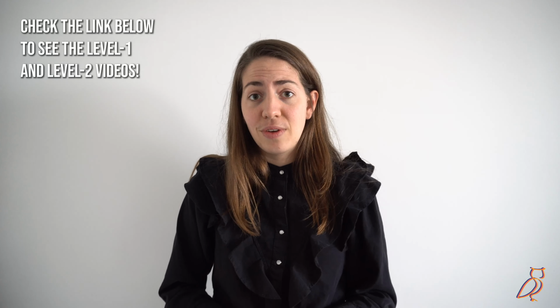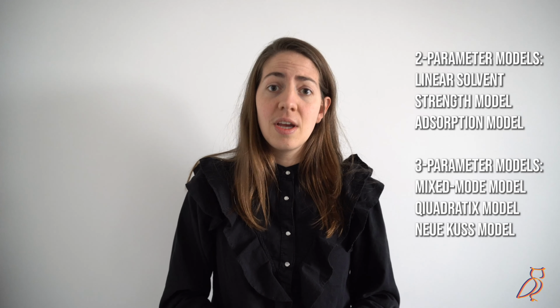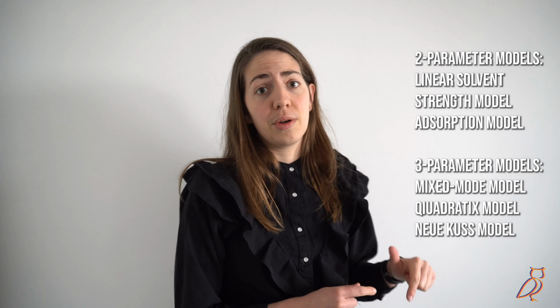So let me set the stage here, okay? You got intrigued by the idea of applying retention modeling and you go to the lab, you have a sample in one hand and a column in the other. You go to the lab and suddenly you think, well, what do I do now? What do I measure? As I told you in one of our previous videos, when you apply semi-empirical models, like these, you only need a small number of experiments, depending on the number of parameters of these models.